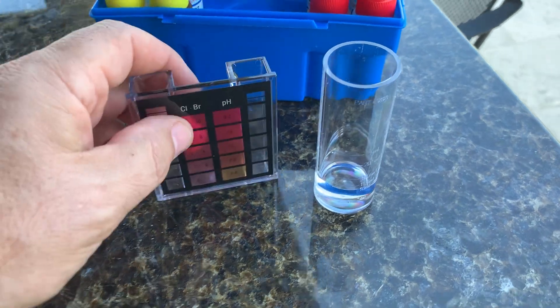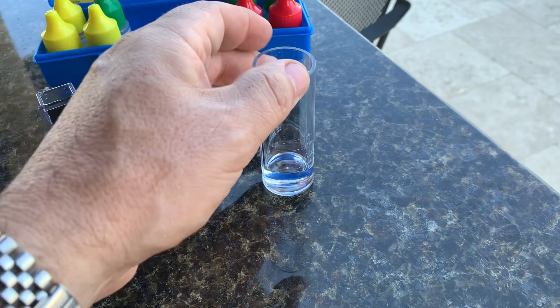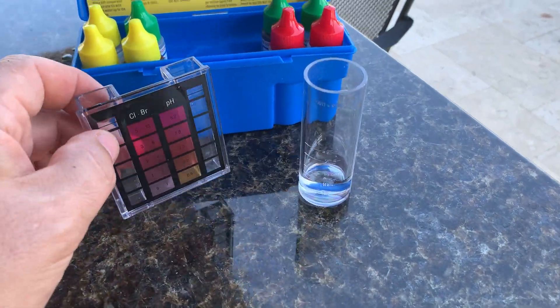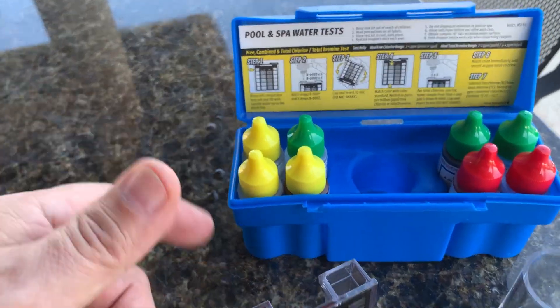They give you two containers here for the water to test — this one for your chlorine and pH, and then this one here for your alkalinity. It's a really very inexpensive set and this is one that's kind of my go-to all the time.